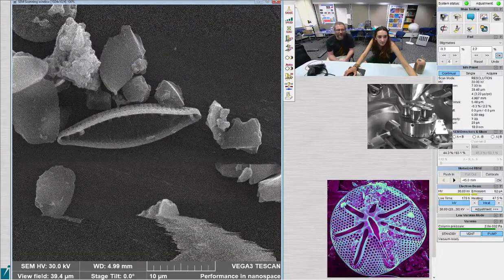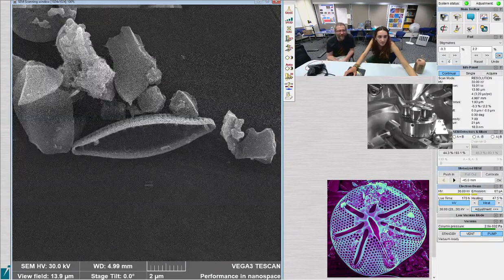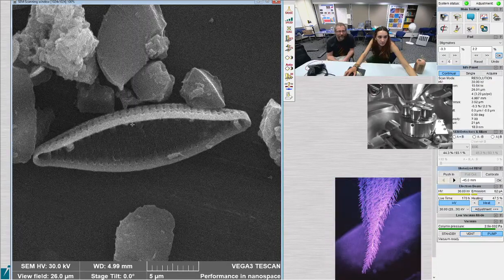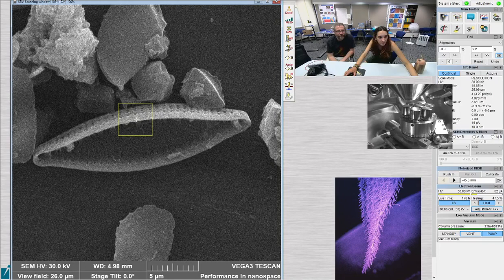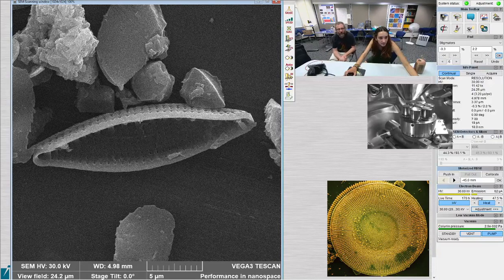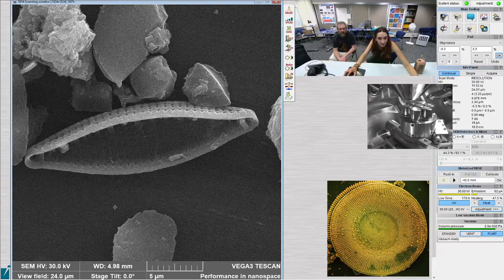Cars are so roomy. Yeah, it's a Nitzschia. Oops. That's a kind of interesting one. It's in, like, three-quarters girdle view. That's pretty. Yeah, and the stripes come all the way down onto the girdle, which is kind of interesting. Here. Yeah, on both sides.